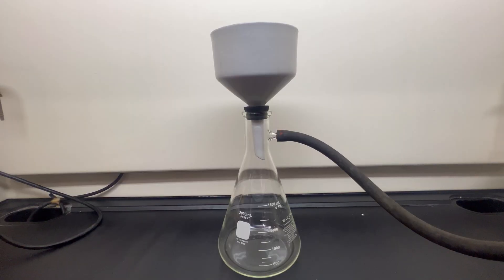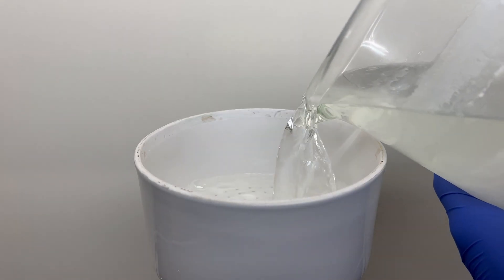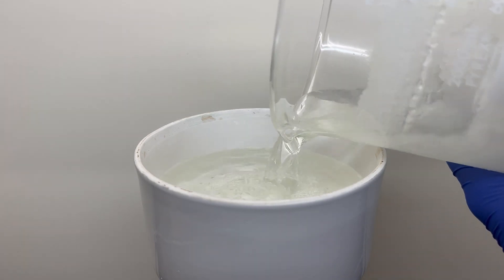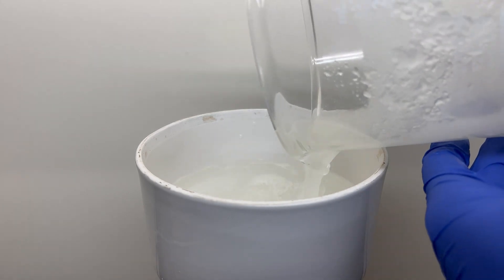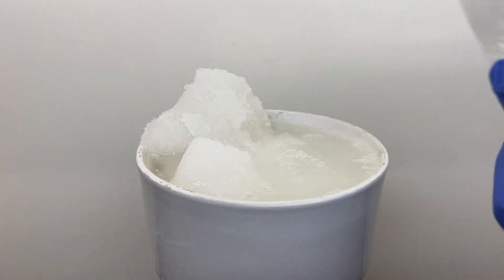The boric acid is then transferred to a filter funnel and washed with cold ice water. If you desire highly pure boric acid, a recrystallization step can be done, but for my purposes, baseline is good enough.